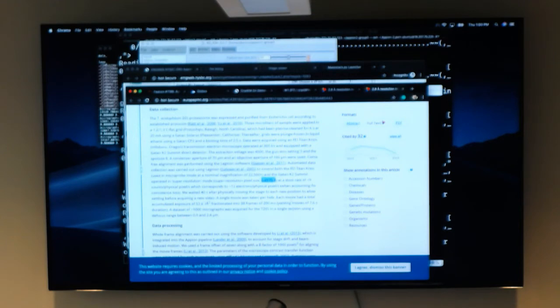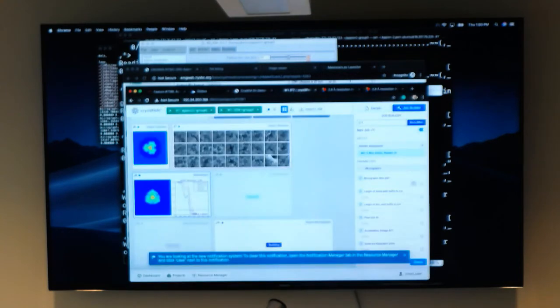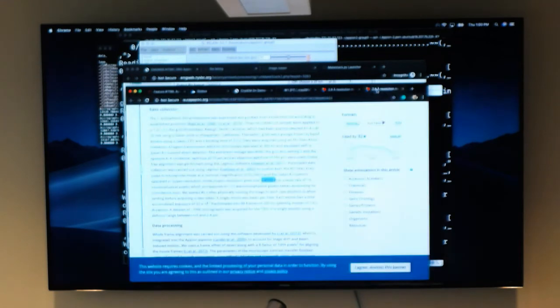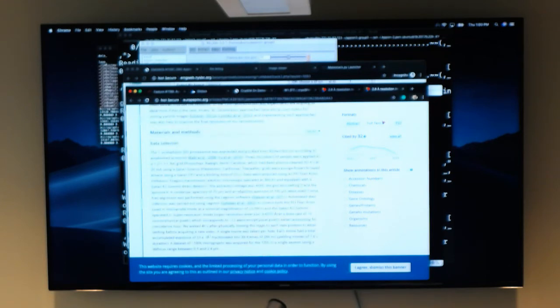So if you decide that, let's say you've gone through this test tutorial, GDH, you're ready to go, and you want to use the EMPIAR data set, these are aligned sums. Pixel size, 0.6575. Cs, 2.7. Total dose is 53. What other information do you need? And this is a 300 kV high tension. You can always get that from the paper.